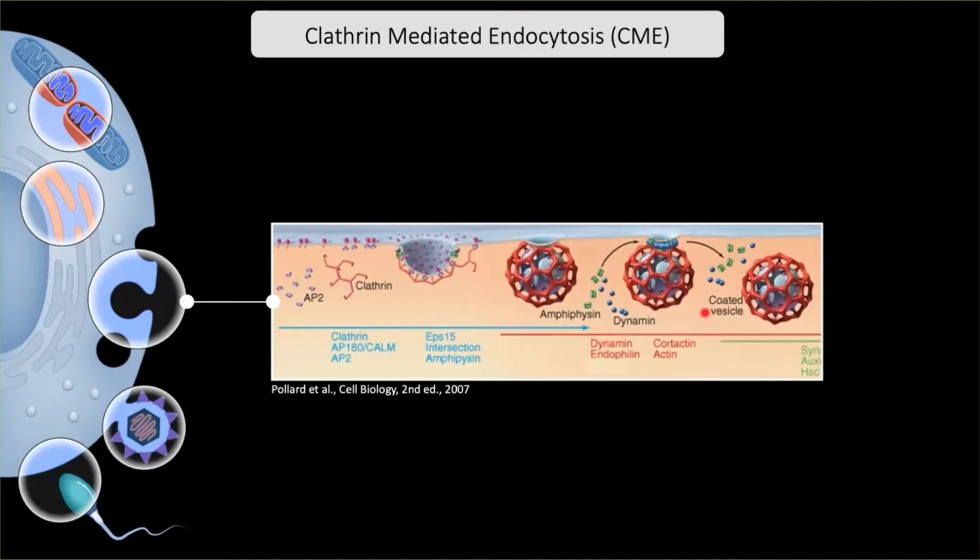It's extremely difficult to assign these functions. And the reason is that like many processes that happen in the cell, this event is on the order of 100 nanometers, so it occurs way beyond the standard diffraction limit of light. It's highly dynamic, and it's also complex. It involves a complex protein machinery and complex regulation.